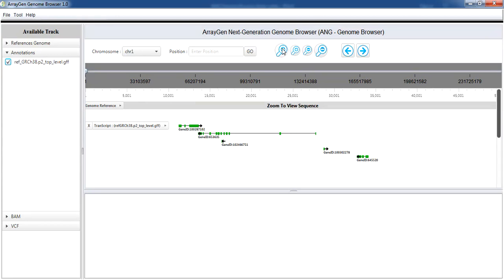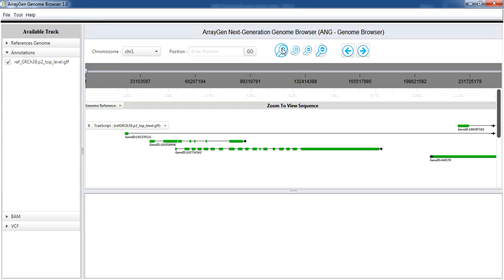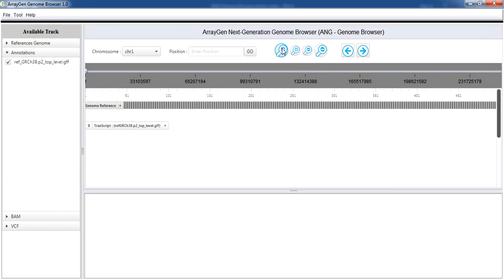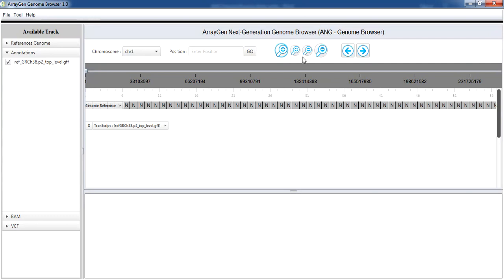The sequence can be zoomed in and out using plus and minus icons in the toolbar. The smaller and larger zooming icons zoom to intensities plus 1 and plus 2 respectively.